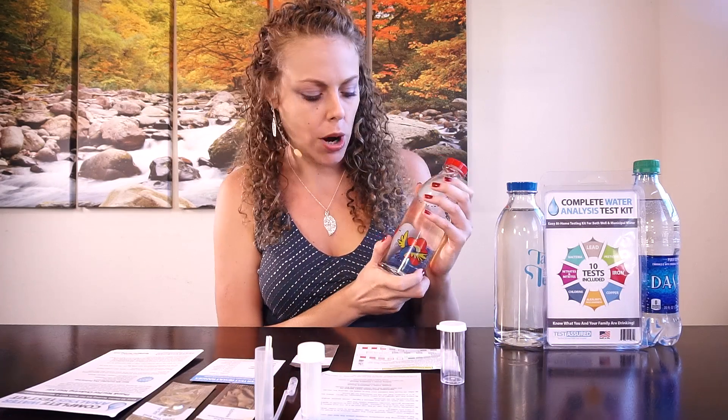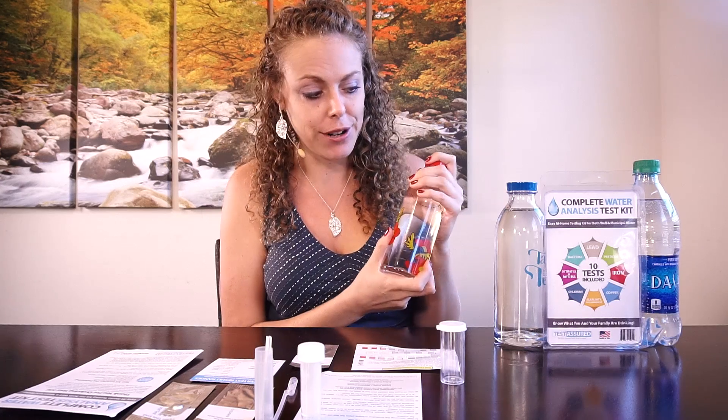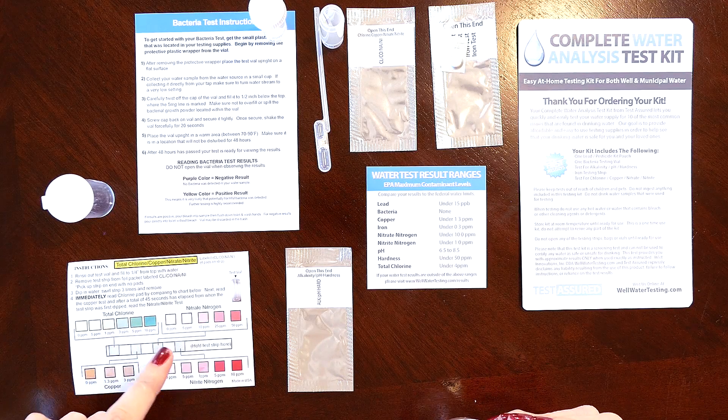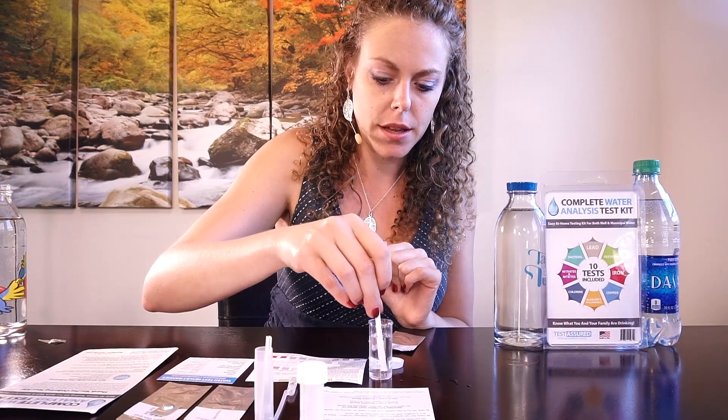Let's go ahead and start testing the water. I'm going to start with the Best Water Factory filtered water, which I'm thinking is going to be the cleanest of the different water sources. We'll start with the chlorine, copper, nitrate, and nitrite test, dipping in the water and swirling.